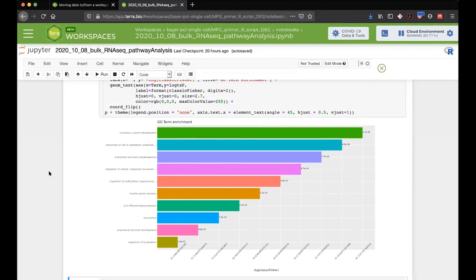And seeing as it's 9:20, that's about the time we have for today. So shoot me an email, ahall@broad, if you have any questions, I'll try my best to answer. This is just a quick view through what I typically do for RNA sequencing, differential gene expression analysis and some of the plotting that I do to support that. I hope that it's been helpful, and I'm happy to take any final questions if we have time.